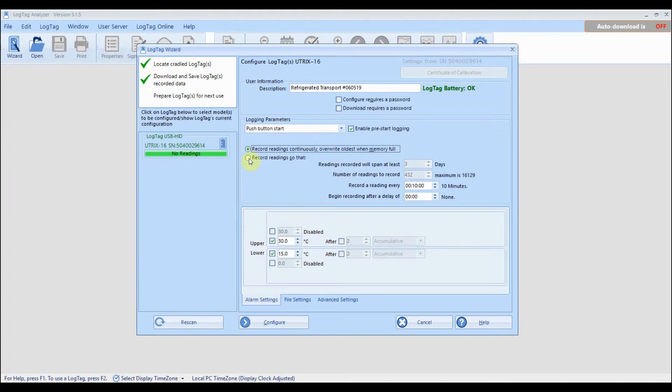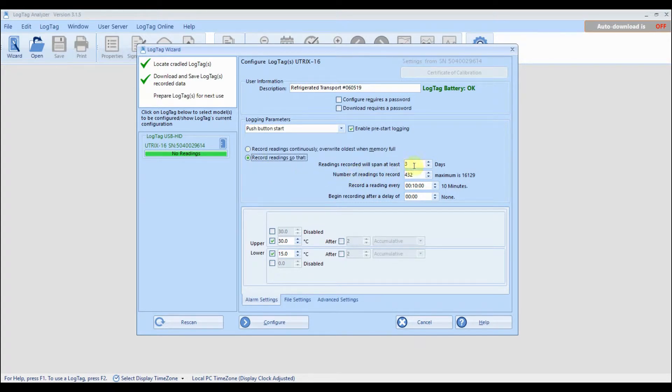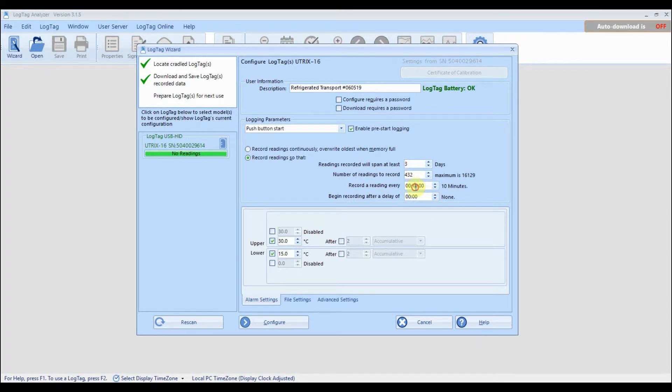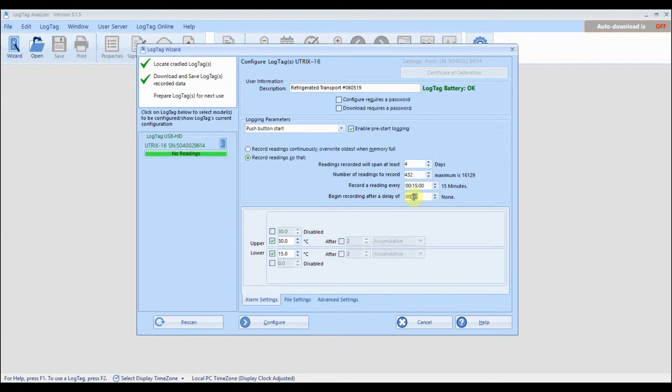If continuous recording is not selected, you can specify the number of days you wish to record for. The number of readings to record is changed according to the duration and frequency of your readings. Specify how often you want your logger to take a reading and the maximum number of readings the logger can take will be displayed.